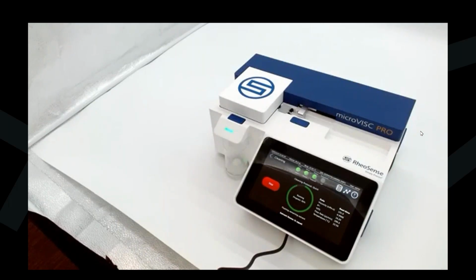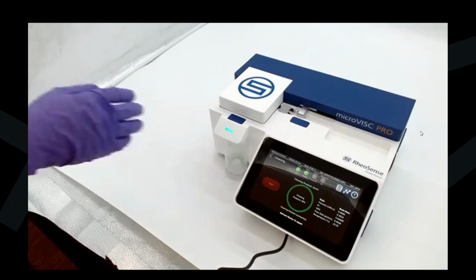So it looks like it's almost done cleaning. It's at about 95%. And it looks like it's done. So now the pusher block is moving back to home position.